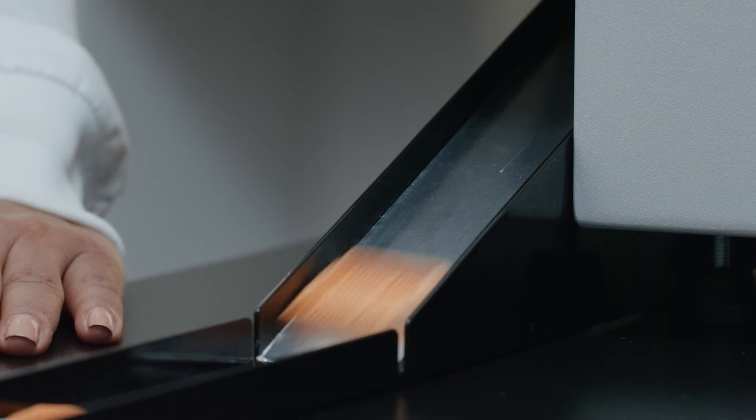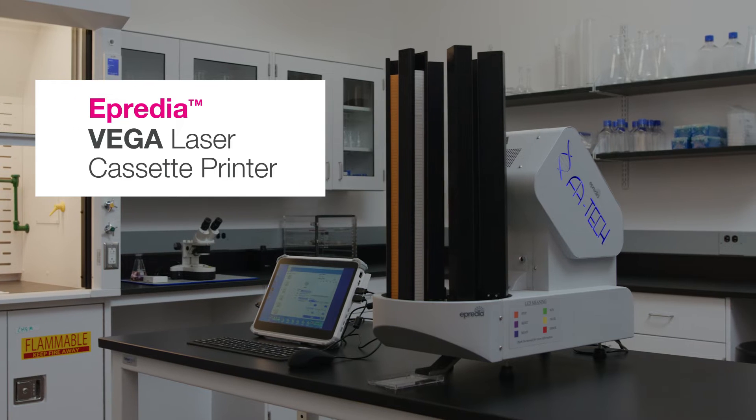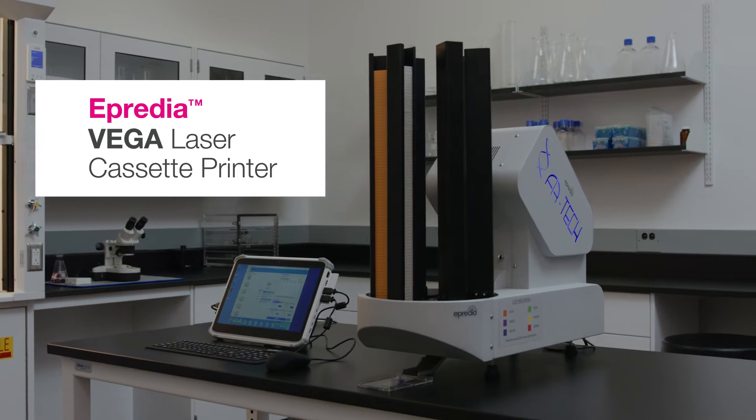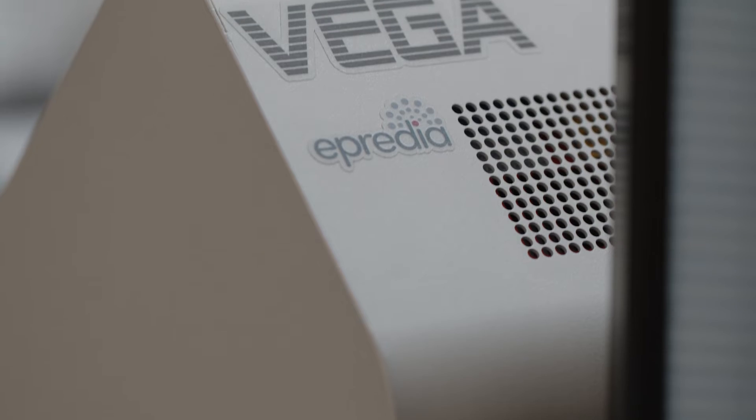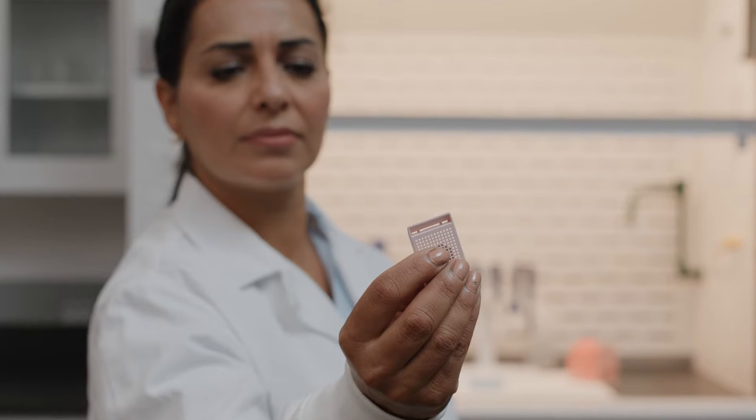Comprehensive sample identification demands advanced printing capabilities. The Apridia Vega Laser Cassette Printer offers the high-resolution printing you need for labeling and identifying precious tissue samples.